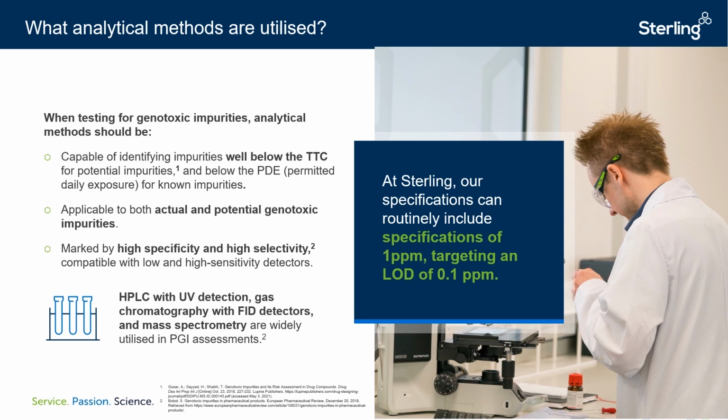Next, testing should consider both actual and potential impurities. As we've discussed, genotoxic impurities can arise at any stage, and having an idea on whether they may form later on can help mitigate added challenges in the long run.